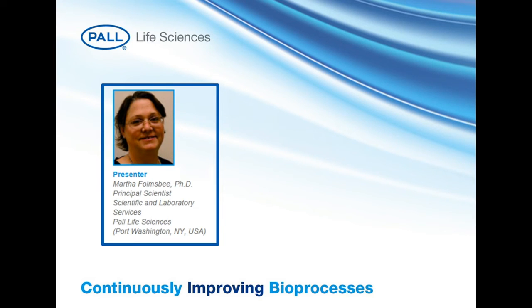First, it's rated as a sterilizing grade filter by the manufacturer, which includes stringent quality controls to ensure that each filter meets that specification. And since the rating test for a filter is a bacterial challenge test, which is a destructive test, that means that we also need a non-destructive test to be able to test each filter prior to release. And this is why the bacterial retention rating test is also correlated to a non-destructive test called an integrity test. Each sterilizing grade filter is then tested using that associated integrity test prior to release.